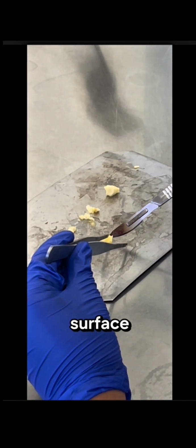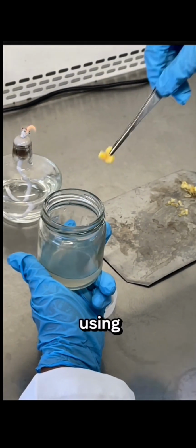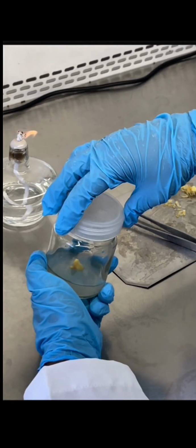Cut the plantlet to ensure it can stand on the agar surface. After the plantlet is put in the media glass, seal it using parafilm and let it stay in the control room in the tissue culture lab.